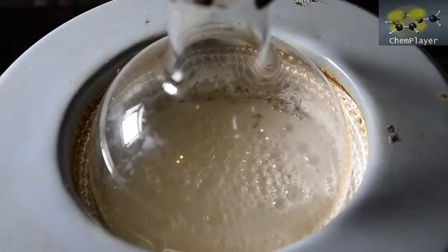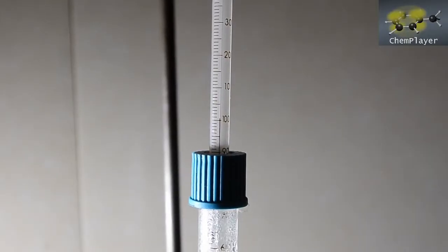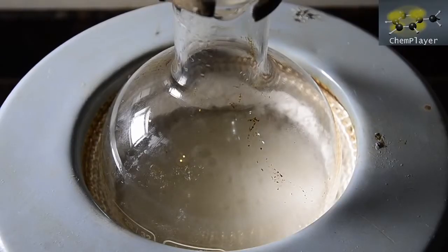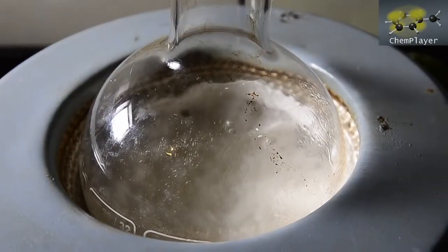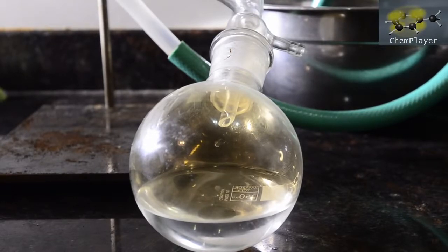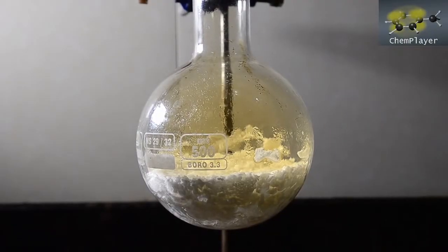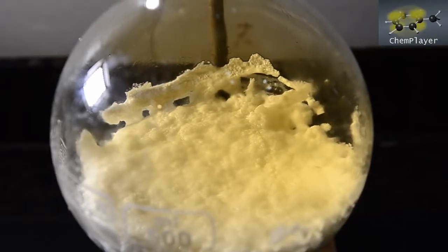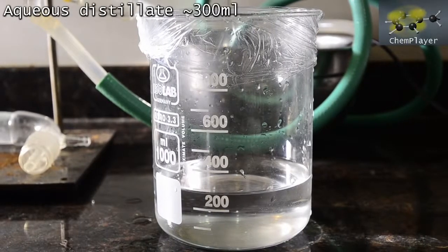At the end we've got a liquefied inorganic salt mixture in the flask, and distillation slows right down until hardly anything more is coming over. Right at the end we get some brown nitrogen dioxide fumes forming in the apparatus. We stop the distillation here.